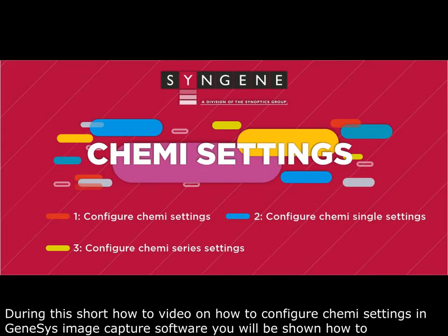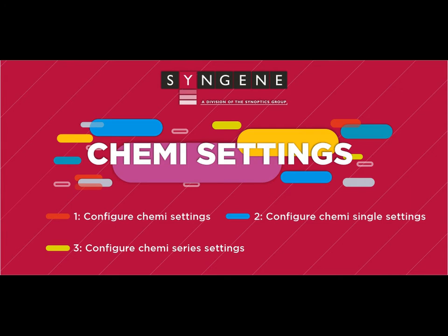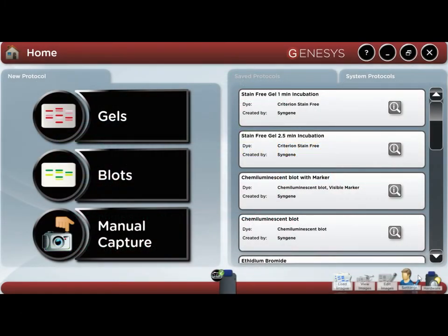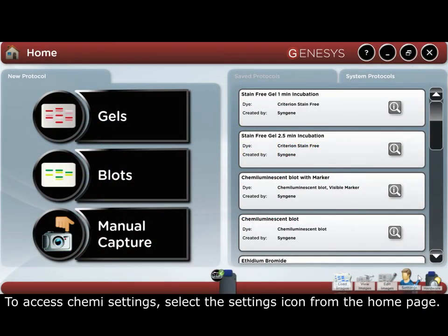In this short how-to video on how to configure Chemi settings in GeneSys image capture software, you'll be shown how to: 1. Configure Chemi settings, 2. Configure Chemi single settings, and 3. Configure Chemi series settings. To access the Chemi settings, select the settings icon from the home page.